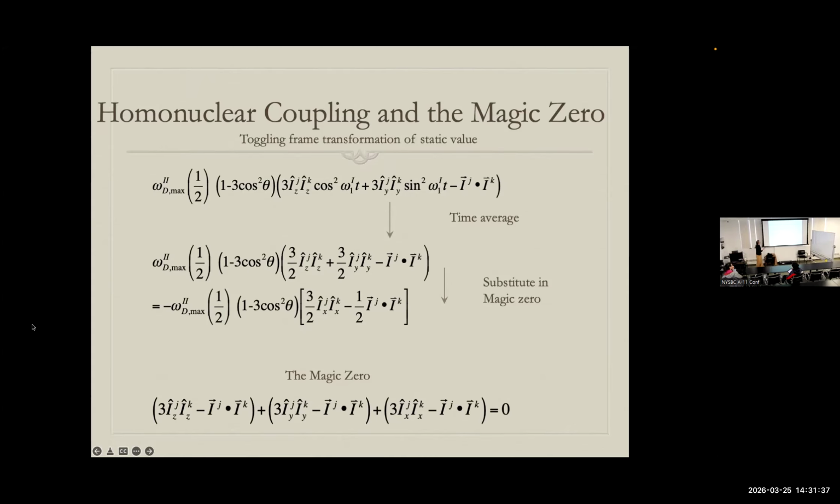Let's see, this is where it was still time dependent, homonuclear, right? And then this was after the time average. It's just self-matching because the two protons always have the same RF, so you always end up preserving some under this family of pulse sequences. So I didn't make it go away. The pulse sequence did not make the homonuclear coupling go away.